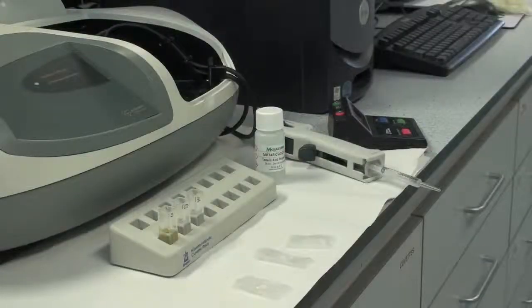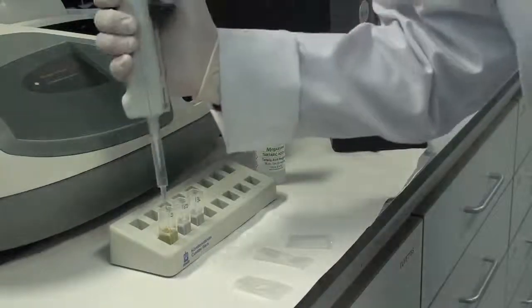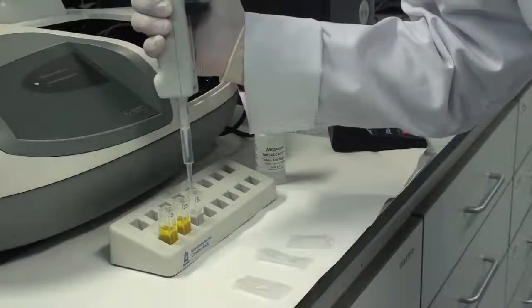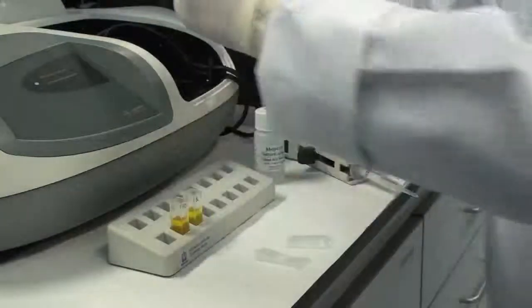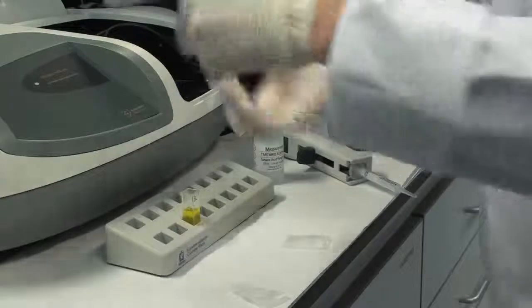After taking the absorbance reading A1 for each solution, add 0.25 millilitres of Tartaric Acid Reagent 2 to each sample, standard, and blank. Mix each solution, then exactly 4 minutes after the addition of Reagent 2, read the absorbance A2 for each solution.